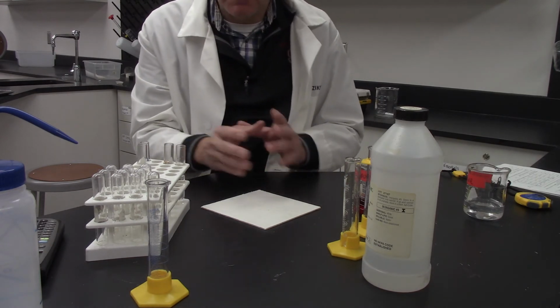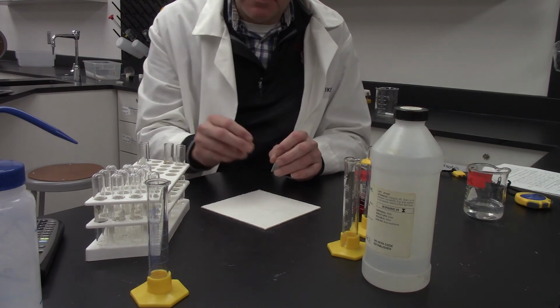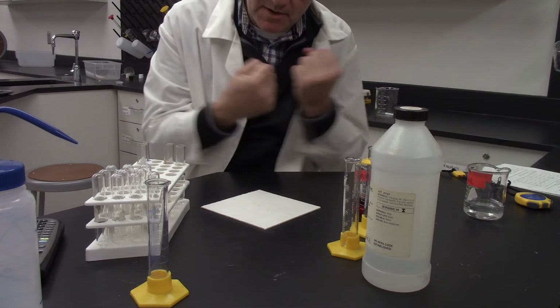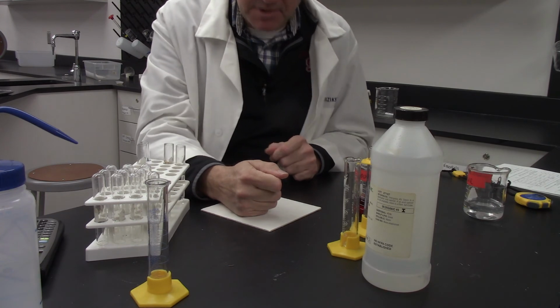And then I'm going to warm it up probably to about 30, 35 degrees, something like that, and then I'm going to run it. That reaction is going to take place really, really quickly because now these particles have so much energy that they're colliding so rapidly that the reaction is going to take place very quickly.